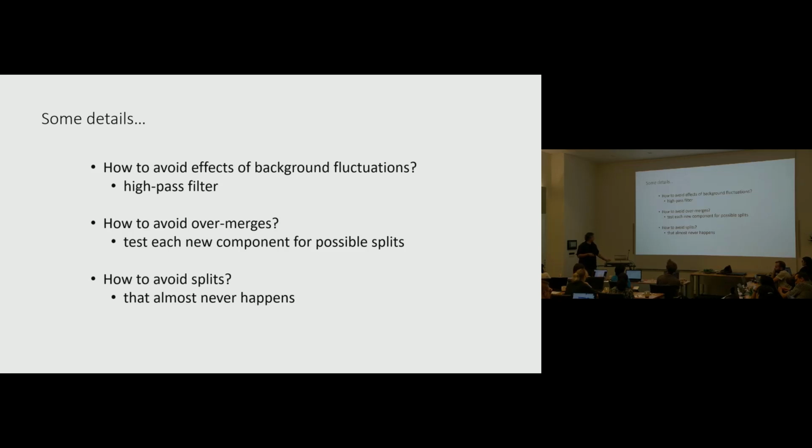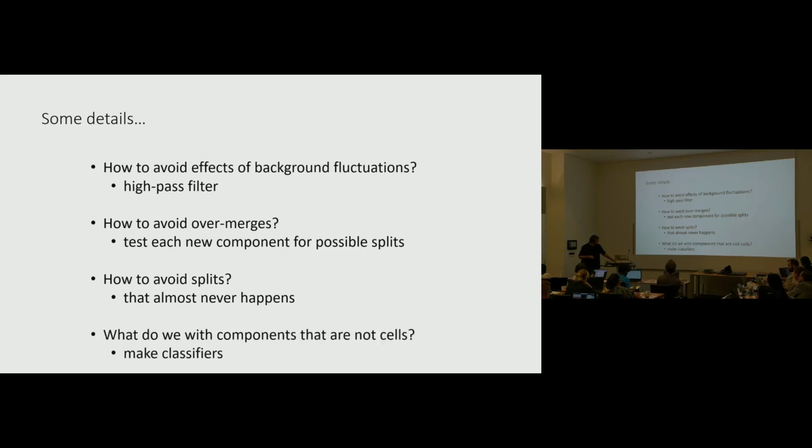That could be one good thing to do in the GUI, because I think it'll be a pretty fast program, since it doesn't depend on the raw data, just on the extracted ROIs. There could be a button where you test some level of merging things back, and if you're happy with some level of it, after you've tried a few, then use that one. So I think that's a good thing to try to do in the GUI. So let's maybe try that.